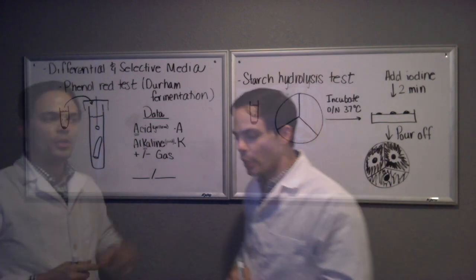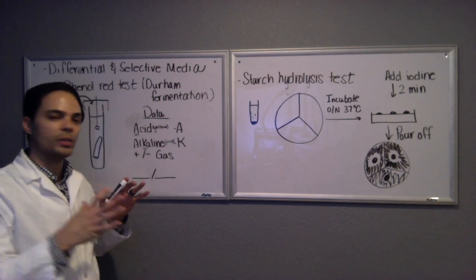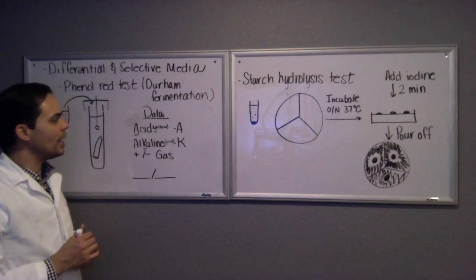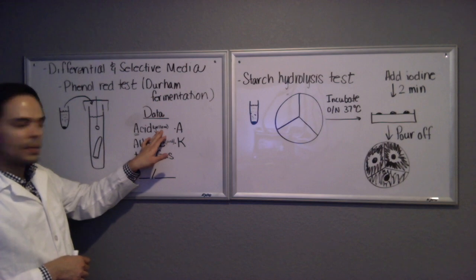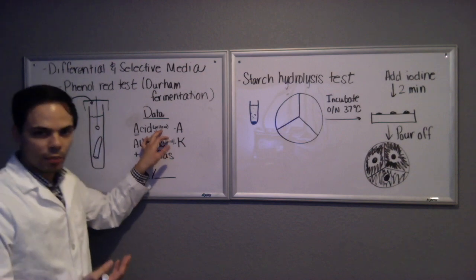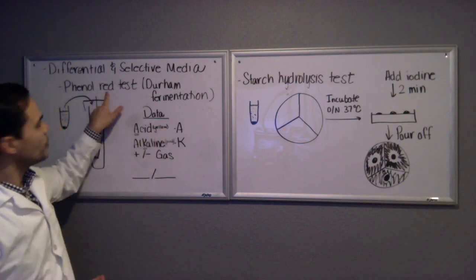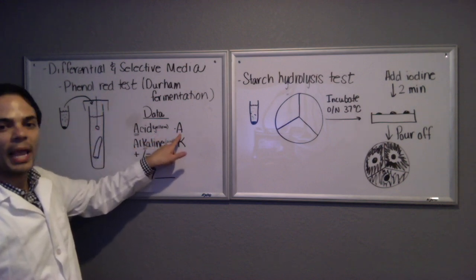The next day when you return, compare the color of the un-inoculated tube to the colors of the ones that you did inoculate. If it turns yellow, that means that the bacteria ate the lactose, fermented it, produced acidic byproducts, and that will turn the phenol red indicator in this test a yellow color. So we would log A for acid.